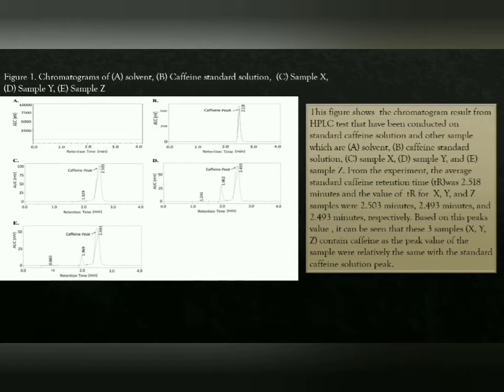A, solvent, B, caffeine standard solution, C, sample X, D, sample Y, and E, sample Z. From the experiment, the average standard caffeine retention time was 2.518 minutes, and the retention times for the X, Y, and Z samples were 2.503 minutes, 2.493 minutes, and 2.493 minutes respectively.